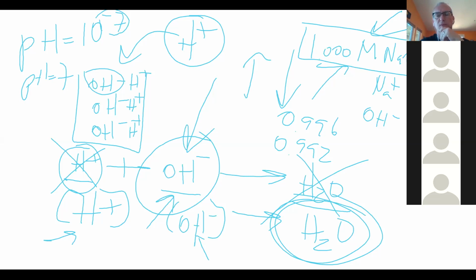It just tells what the pH level is. How do we know what the... It tells the end point of the reaction, like when the reaction has already happened. Yeah, but how do we know? What does it mean? Does it do something? Does it light up? Does it catch on fire? How does it tell us? It'll be colorless in acidic solution and then pink in basic solution.